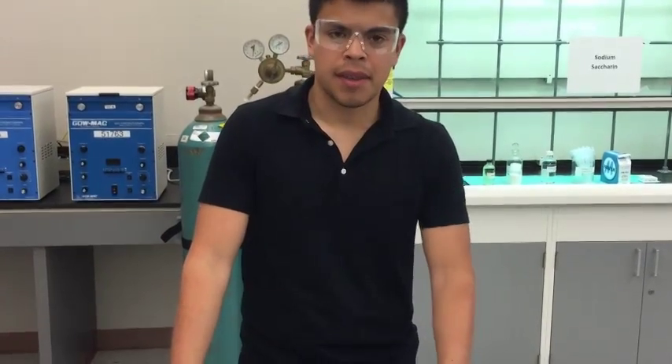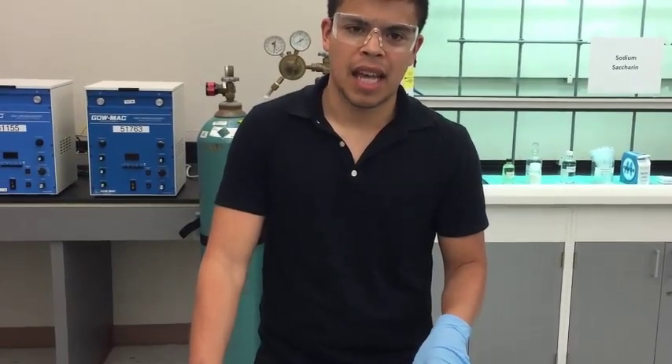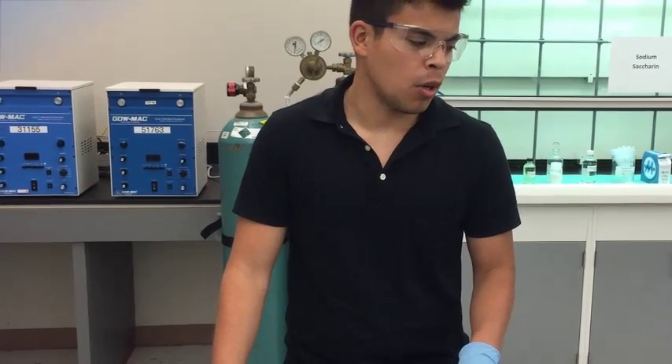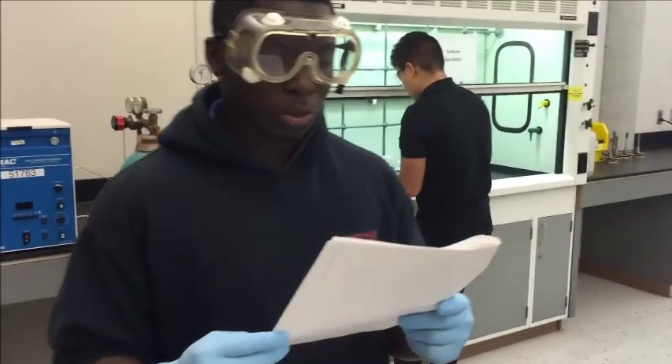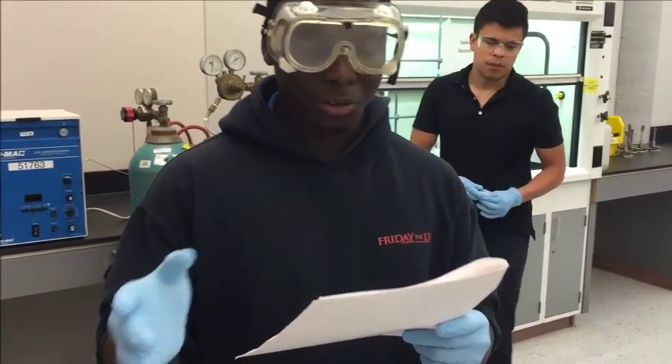Today, what we're trying to do is take iodoethane and sodium saccharin in DMF. Because we're using DMF, we'll have two products: an N-ethylsaccharin or an O-ethylsaccharin. We're doing the reaction of iodoethane with sodium saccharin using an ambident nucleophile.